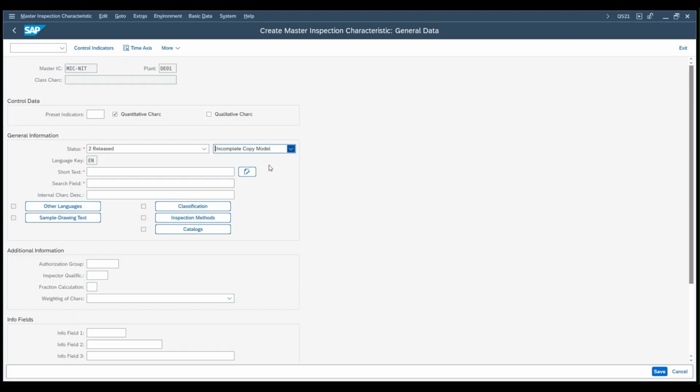procedure, let's say, okay? Creating a reference means that you will have the same characteristics in all the plants that are using these characteristics. Okay, this is more aligned with the more product specific or group of product specific characteristics. So if you need to do a change, you can do the change globally. Okay, you change it in one plant, which you can consider a corporate plant or main plant, and everyone else that is using this characteristic reference will have the change as well, in the specs, for example.